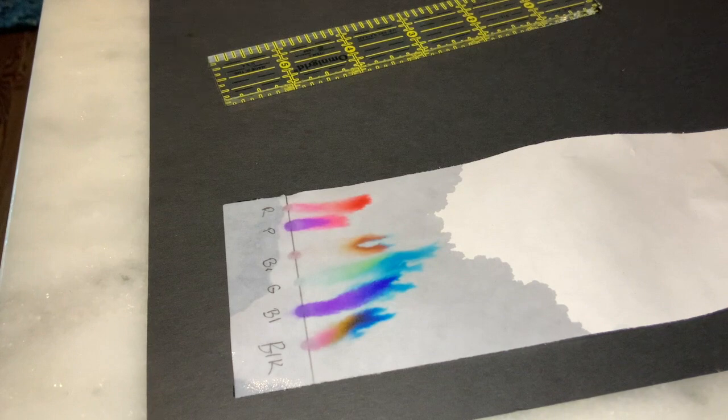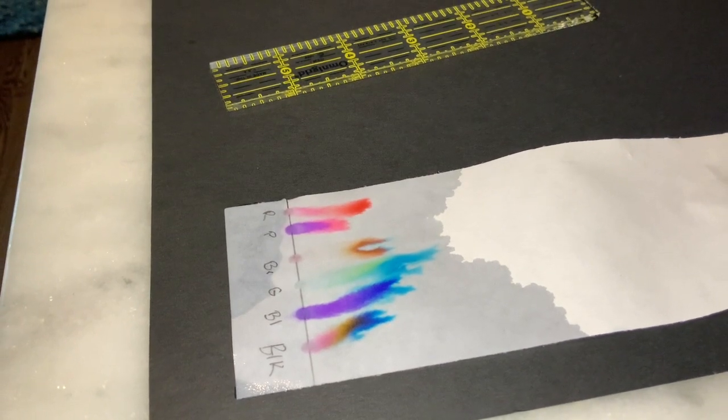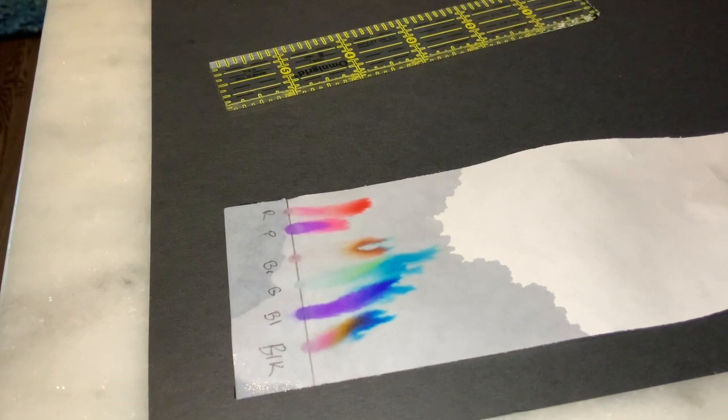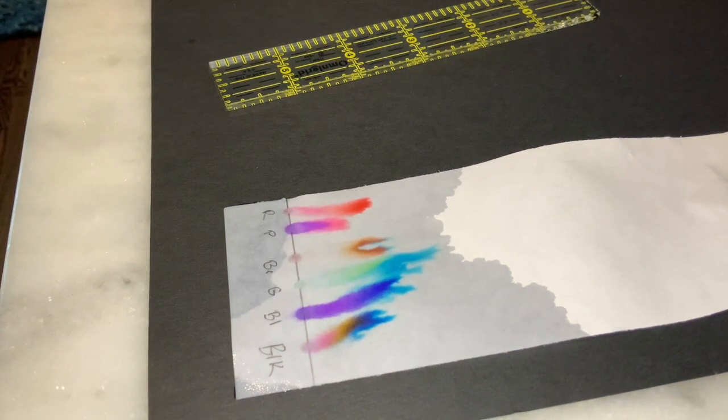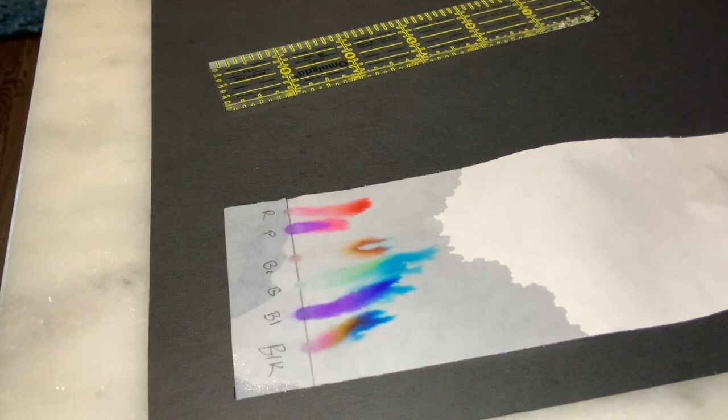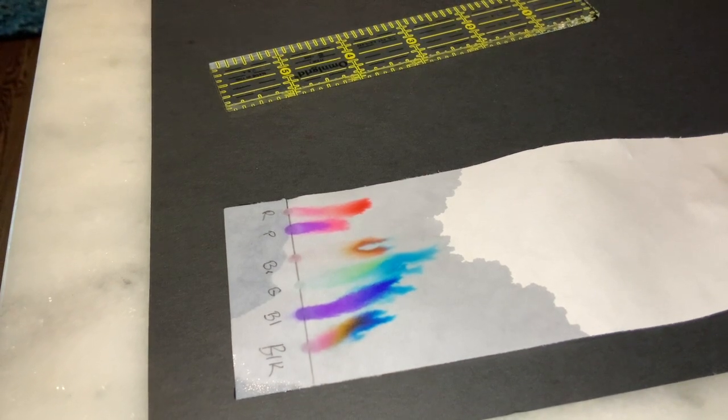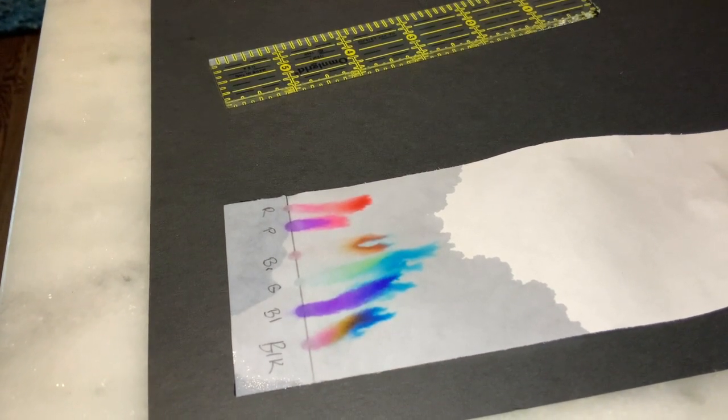So what you guys need to do at this point is record in your observation tables for each pen that we see, record what color dyes you see in those markers, what color inks for each color, and then you're going to have some questions to answer about this.